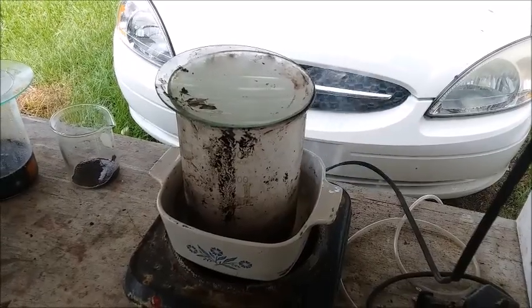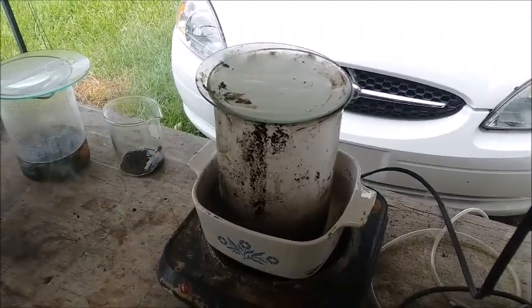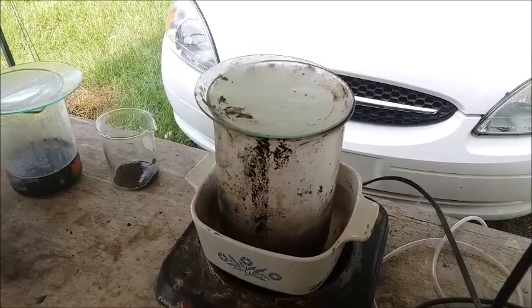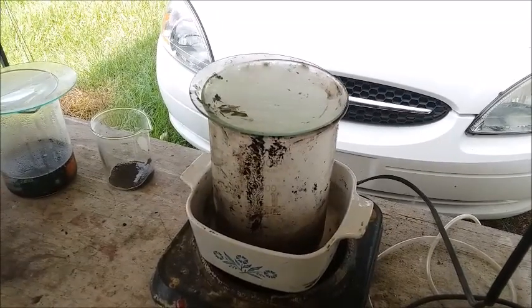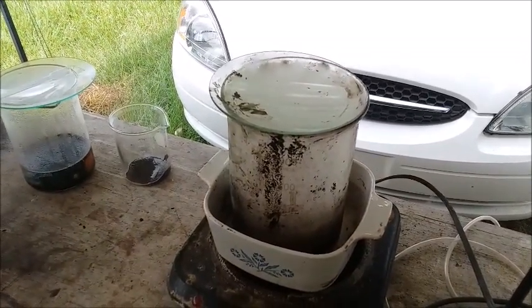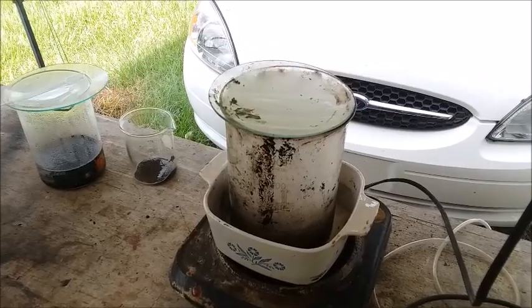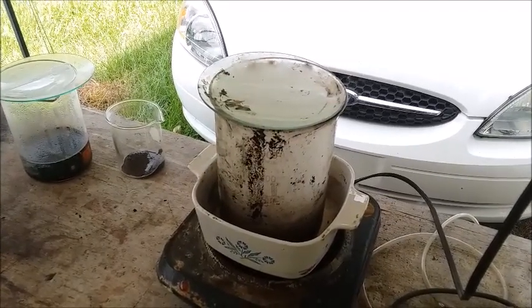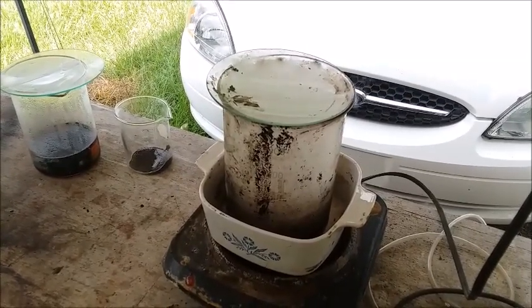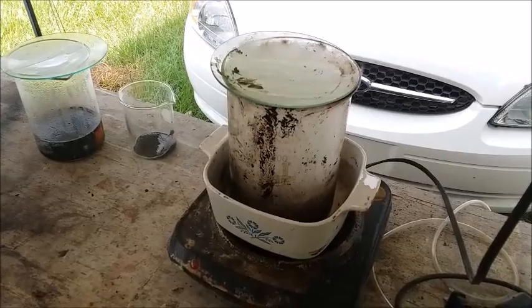Well, here we are with the second acid digestion. Got a lot of fumes coming out, so something's going on in there. Shouldn't take too long, because there wasn't that much epoxy left, plus the little bit of paper towel I threw in there. But I'll let it cook for a good while, just to make sure it's actually done this time. Yeah, I don't particularly like the wet ashing process. I don't do it very often, so, you know, I make mistakes. I should have put in some fresh acid, put it back on the heat, and let it cook for another few hours before I tried draining it. But you live and learn. We'll let it go, see what we get.